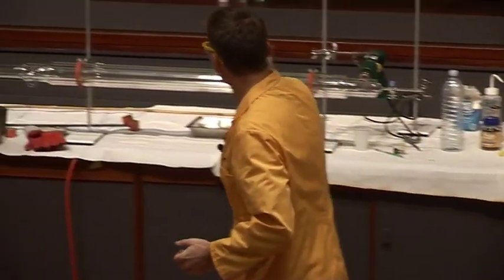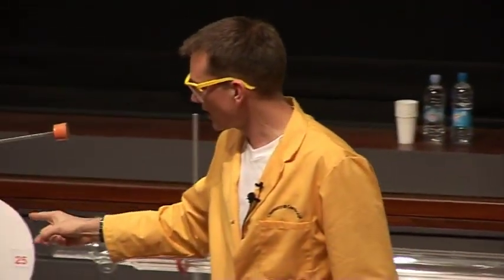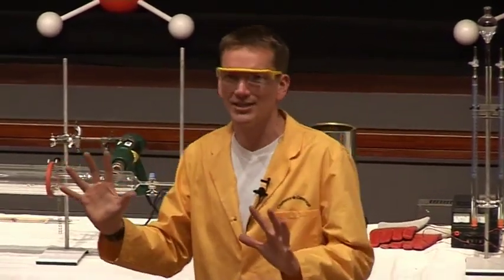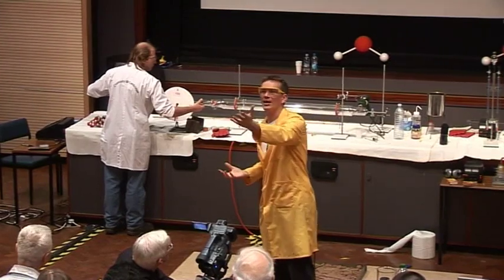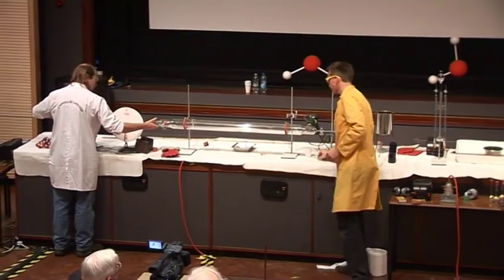Well, we've got an instrument over here to measure this. We're going to see how much 1 milliliter turns into. OK, so on our dial here, we need to watch very carefully. We're going to see 1 milliliter, and it turns into how many milliliters? Well, let's have another guess. Yes, what do you think? How many? Someone down here saying 100, perhaps. 100 milliliters, what could be. Well, let's try the experiment.